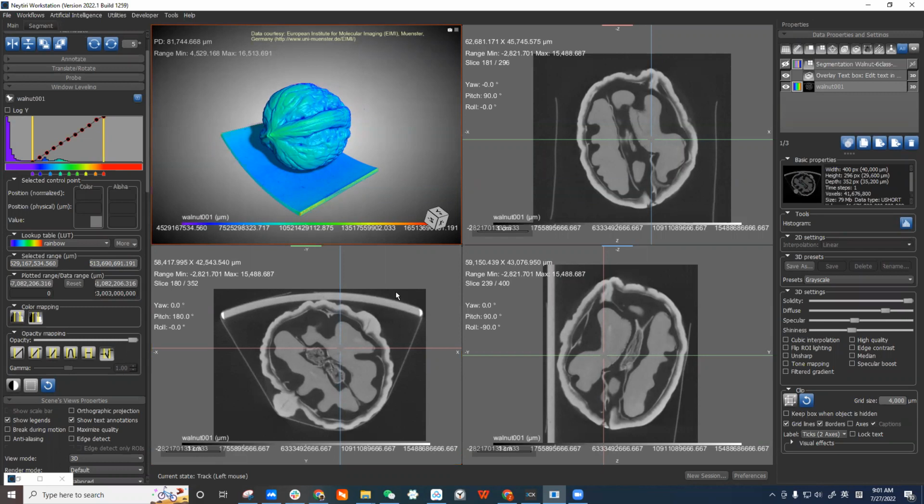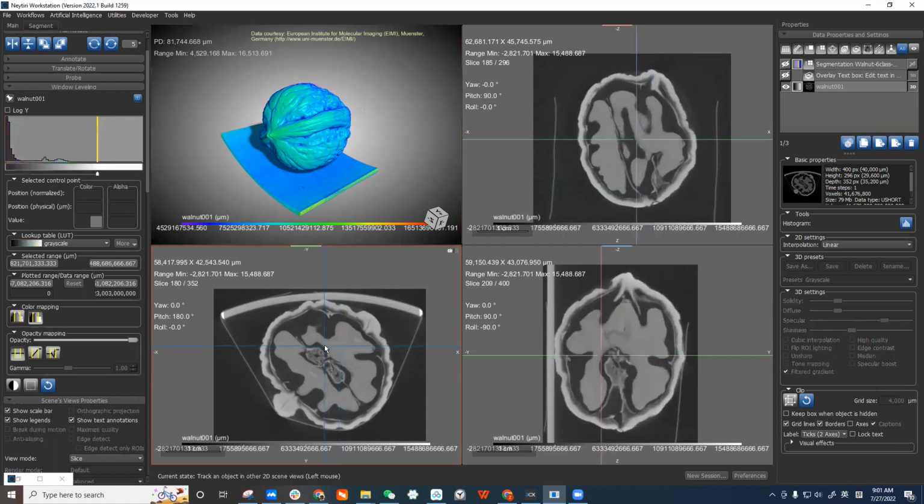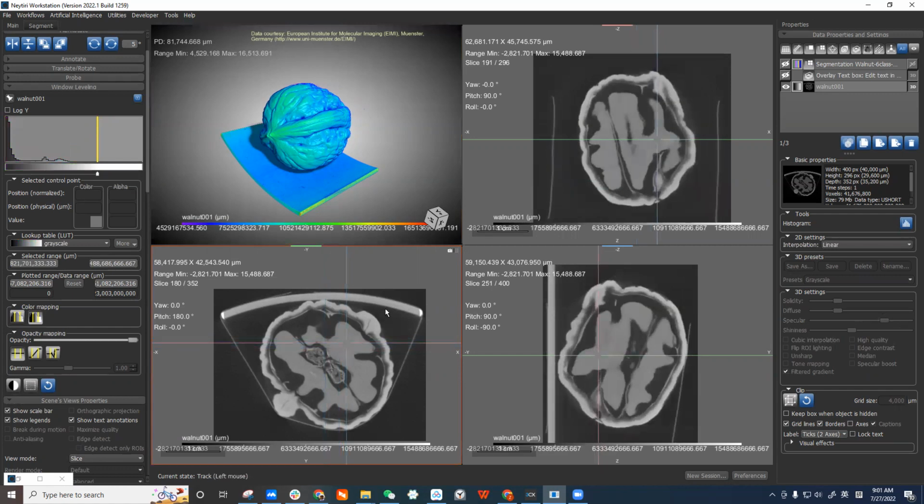We know all the images are saved on the computer as a grid. In a sense, it's based on voxels. So every voxel has an intensity. For CT, it's like an indication of the density, the coefficient for X-ray, right? The attenuation coefficient for X-ray.